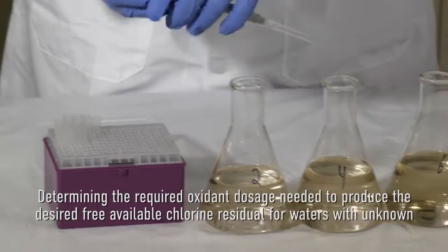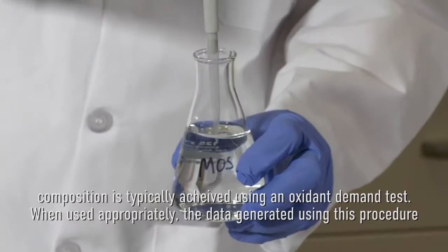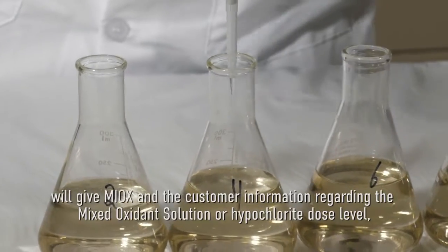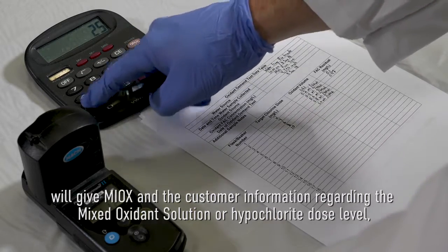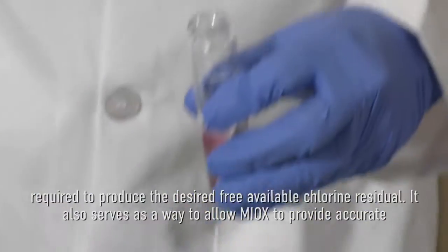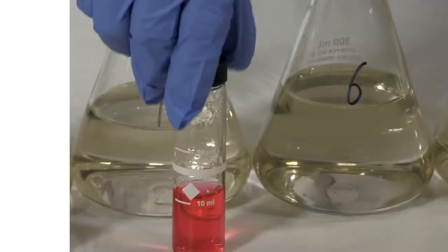Determining the required oxidant dosage needed to produce the desired free available chlorine residual for waters with unknown composition is typically achieved using an oxidant demand test. When used appropriately, the data generated from this procedure will give Miox and the customer information regarding the mixed oxidant solution or hypochlorite dose level required to produce the desired free chlorine residual. It also serves as a way to allow Miox to provide accurate information regarding equipment sizing for the desired application.